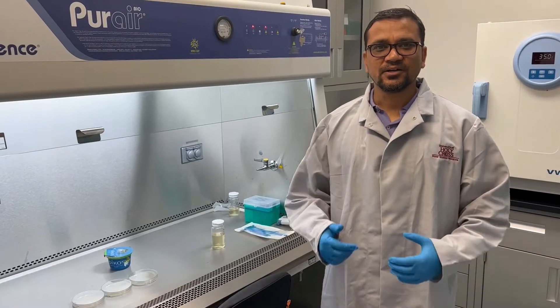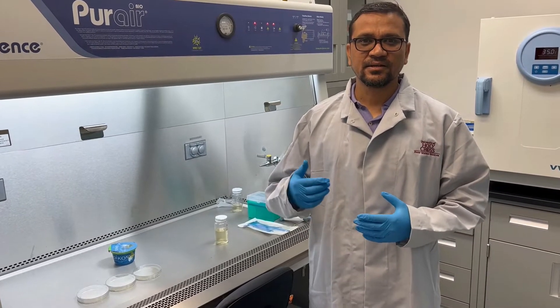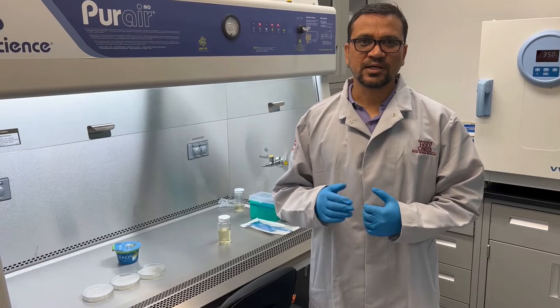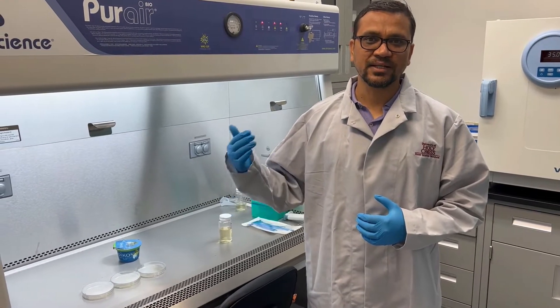As you know, the yogurt sample is very thick and contains different components, so even in one gram of sample we need to dilute the yogurt sample before plating it.